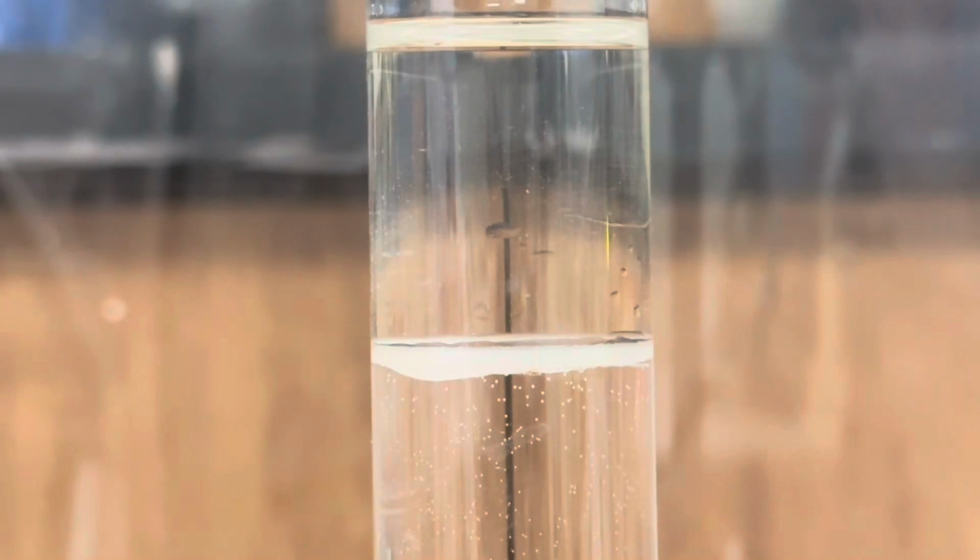And now for the most interesting part, you're going to add those small pieces of sodium and let them fall through the molten paraffin. Ask yourself, why does the sodium rise and fall, rise and fall? What's causing that to occur? Check this out. Okay, here's our first piece of sodium.